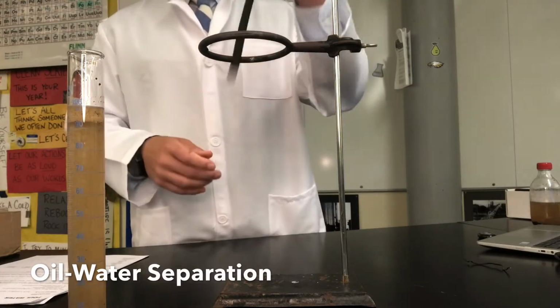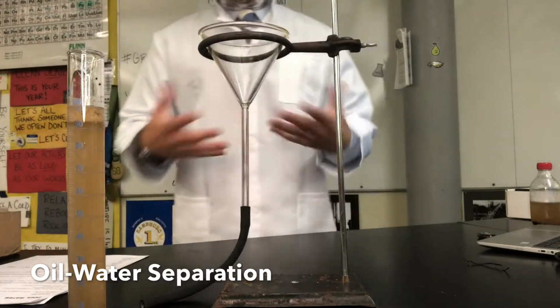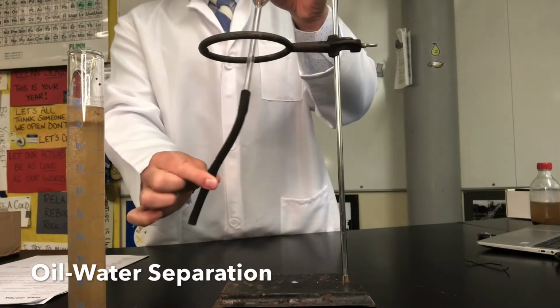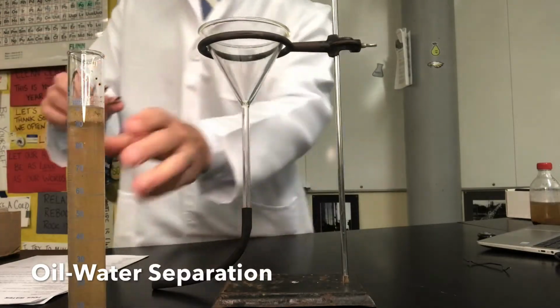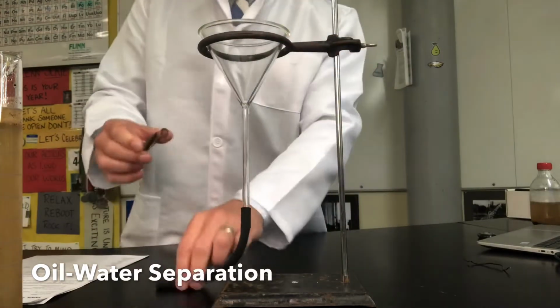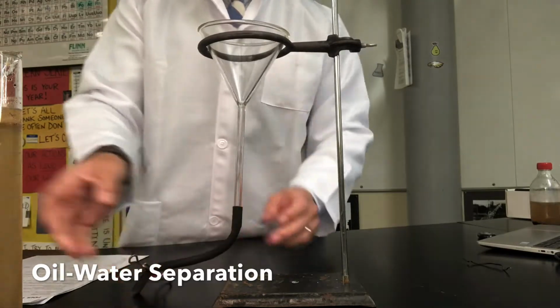We're going to take advantage of the fact that oil and water are immiscible, meaning they don't like to mix together. So what I'm going to do is pinch the bottom of this rubber tube, and to do that, I'm going to use what's called a pinch clamp. A pinch clamp is just a little piece of metal that if you open it and close it, it pinches shut. So I'm going to pinch this rubber tube shut so no liquid comes out.